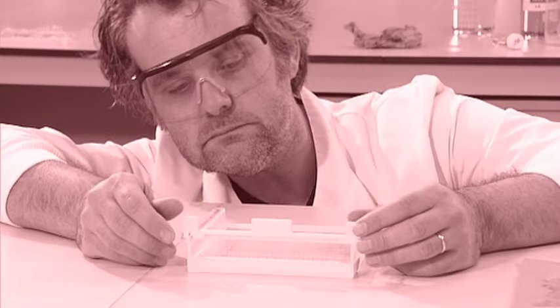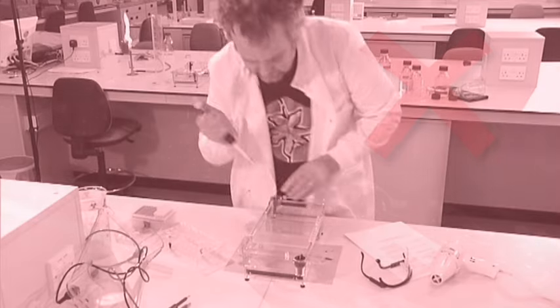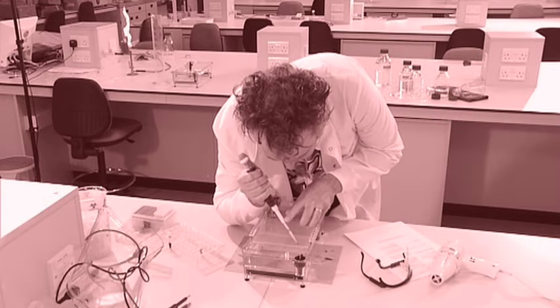Don't remove the comb from a gel before the gel is fully set — that will cause the walls between the wells to be destroyed and the gel will be unusable. Take care not to damage the wells when loading your samples. A damaged well can allow the sample to leak out, may cause contamination of other wells, and can also cause nucleic acid fragments to migrate unevenly.